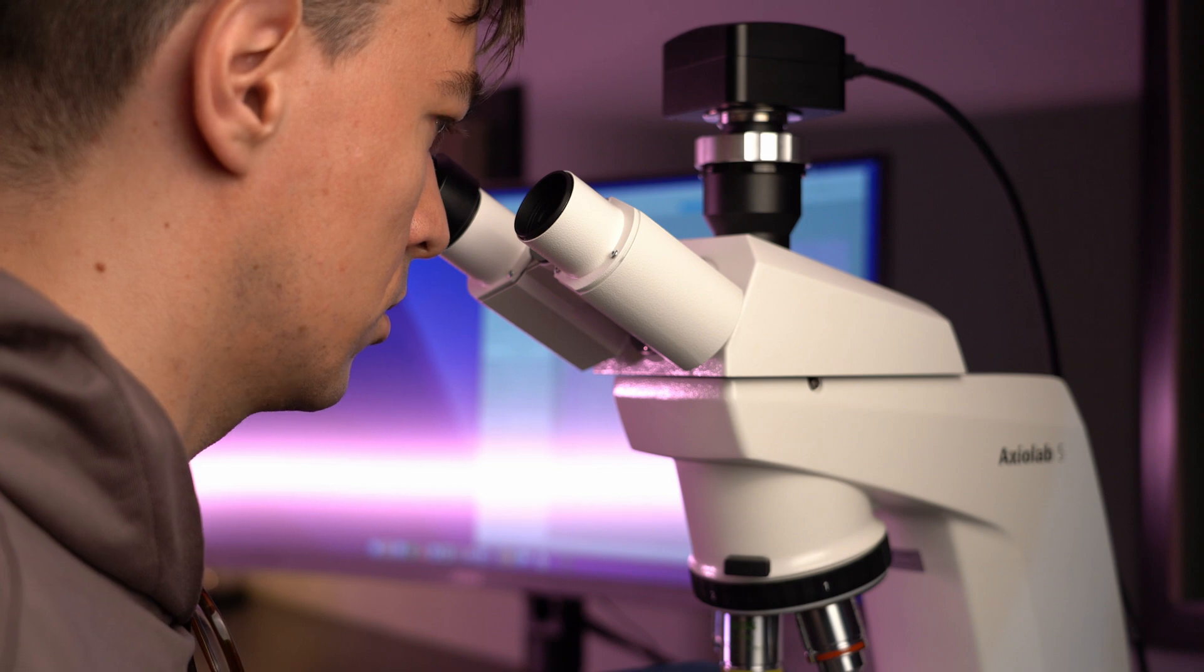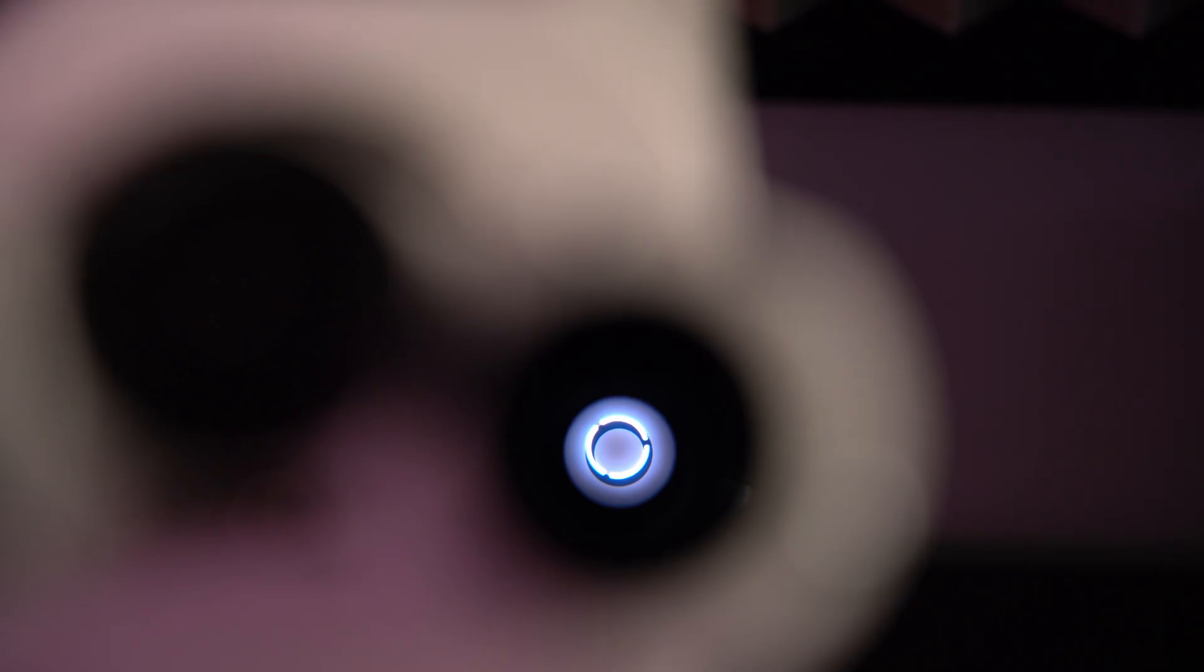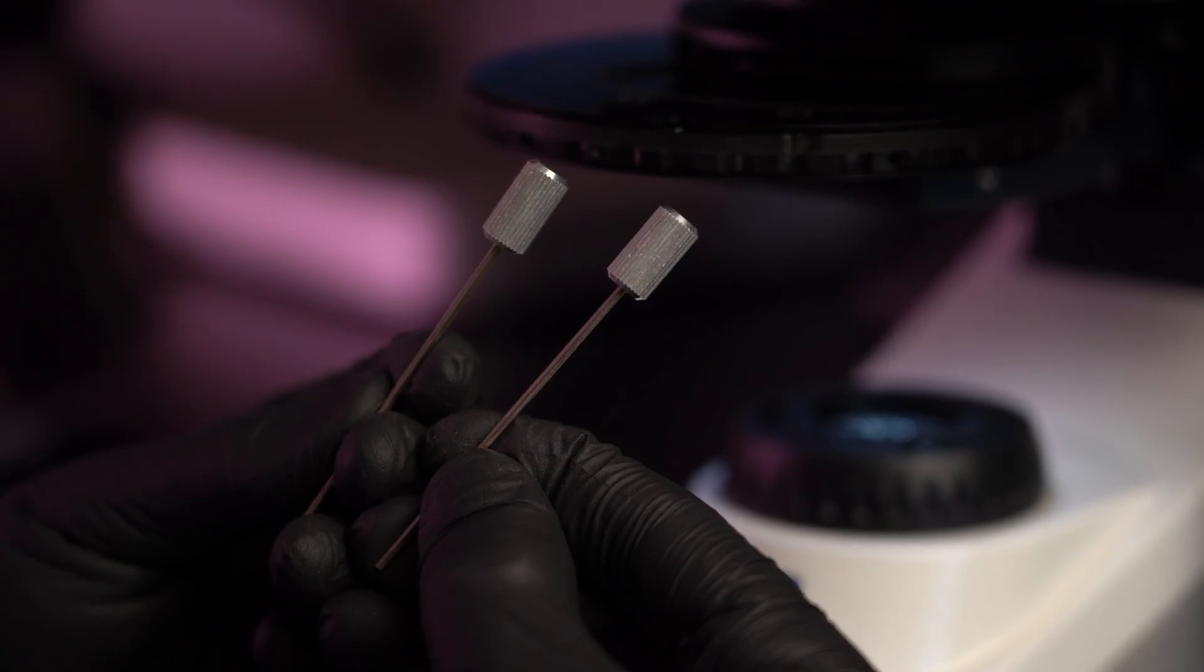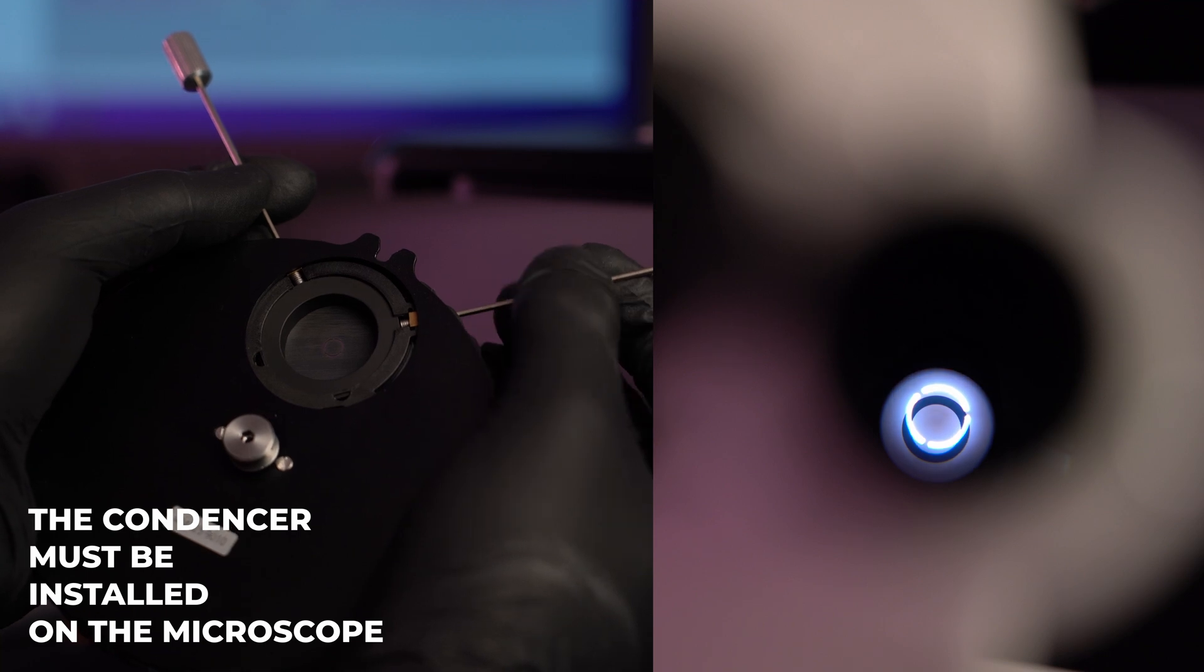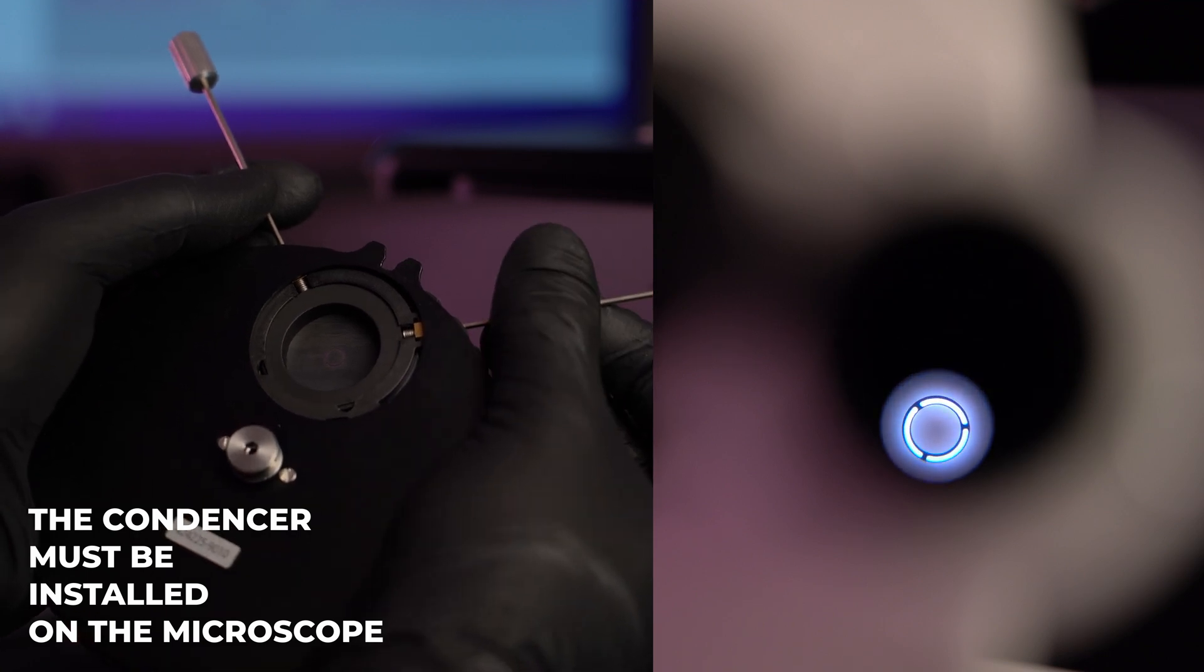It's a special eyepiece with a focus plane exactly on a phase ring. Using hexagon wrenches adjust the phase ring in the condenser coaxial with the phase shifter in the objective.